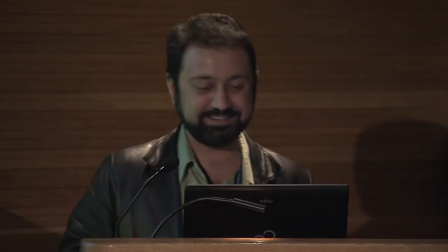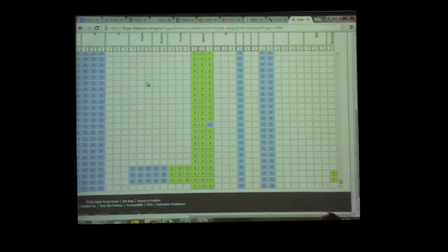There are about seven GDACs, including MD Anderson, where I'm from — MD Anderson is in Houston. We have about seven GDACs, and those GDACs have produced many different online tools. What I'm going to do is show you a snapshot of some of those tools.